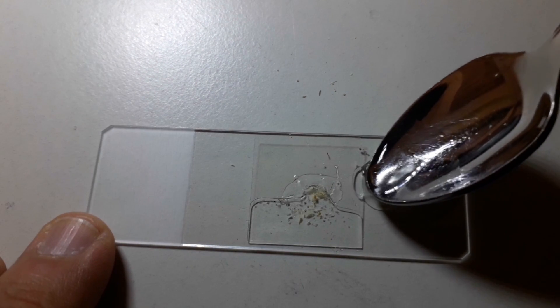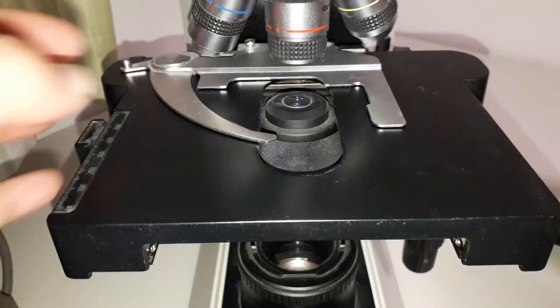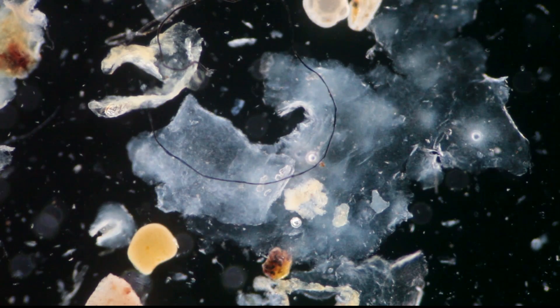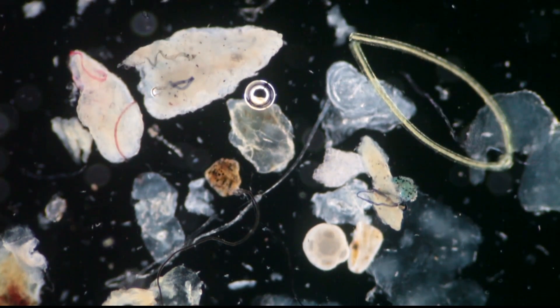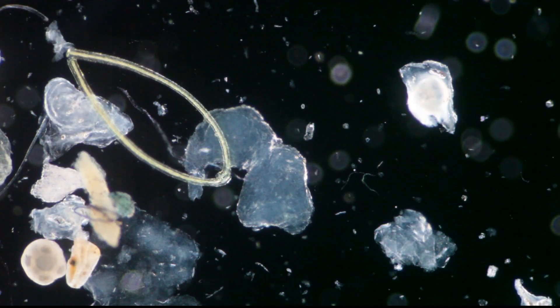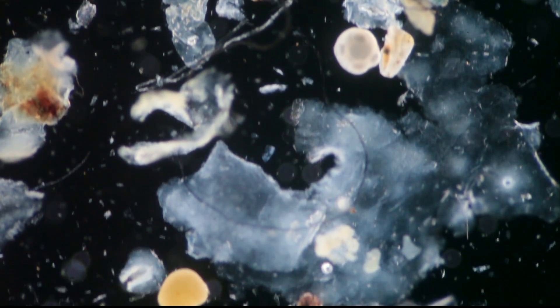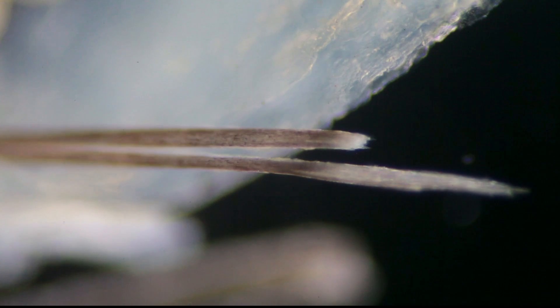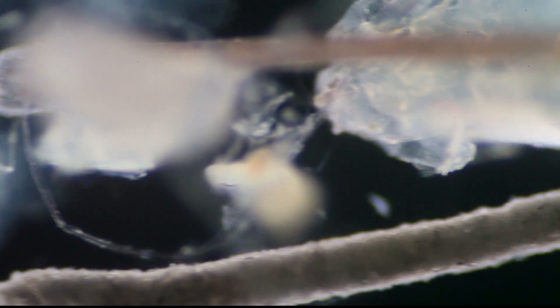I had to look under the microscope first using the low power four times magnifying objective — the one you always start with — and then I gradually increased magnification. What we can see is that the dandruff is a little bit transparent. As I mentioned, this is in dark field, which gives a slightly nicer impression. You can also see some occasional fibers — these are dust fibers, probably from clothing, so maybe polyester or cotton fibers. There is also a hair — a large horizontal structure — and you can see it's kind of split, which is interesting. In the background the white part is again a little bit of dandruff, and I have to focus back and forth so that all planes are visible and in focus.